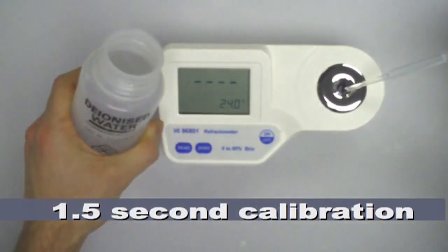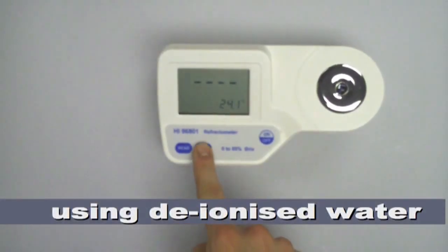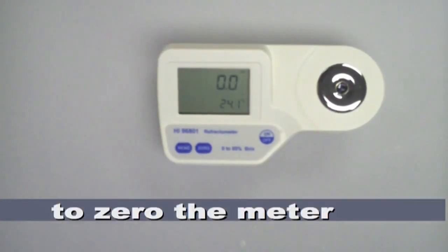Calibration only takes one and a half seconds using deionized water, and the refractometer just requires a couple of drops of sample solution to take a reading.